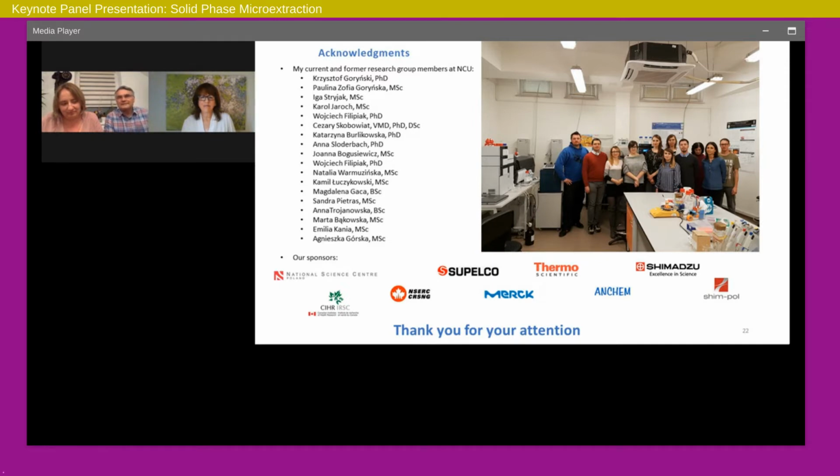However, the format is so simple that it can actually potentially solve a lot of problems. For example, just to give you the idea, one of the futures I see for the technology, and I mentioned that this picture was a drone, is that we can connect patients and environmental pollution, even in remote places, to the central labs. The devices are so light because they enrich the sample in a small volume, like a small fiber or some blades. We also use meshes. You can then easily transport it to a central lab.